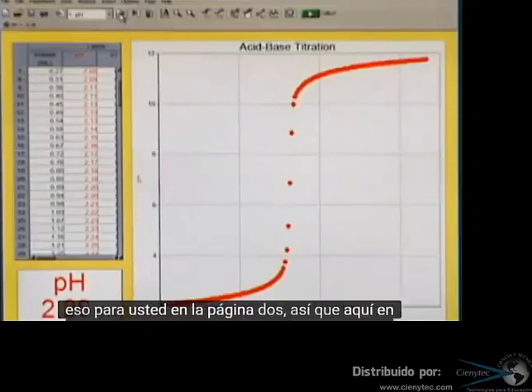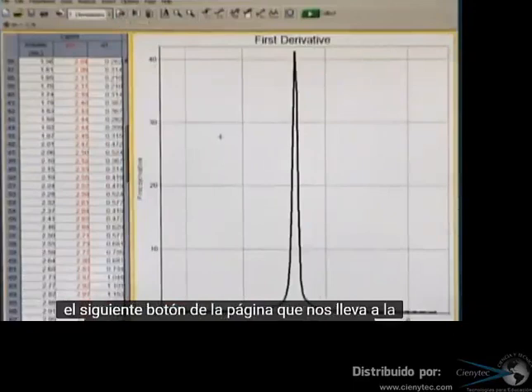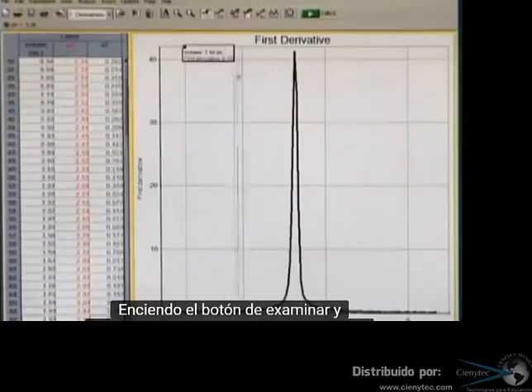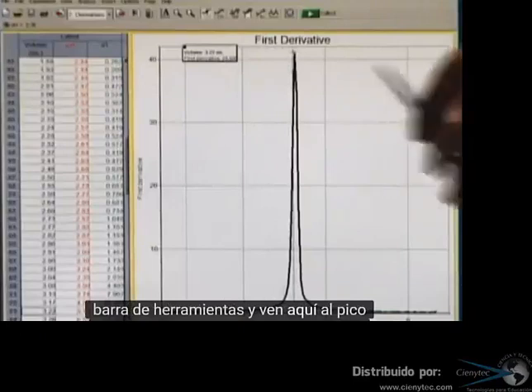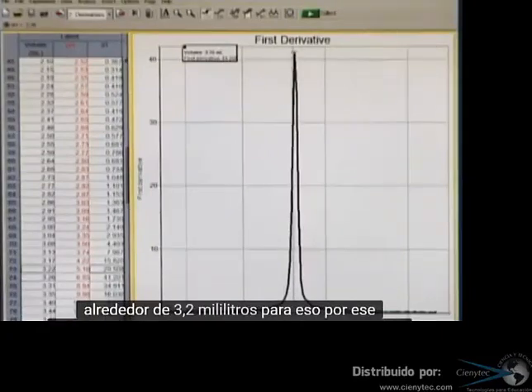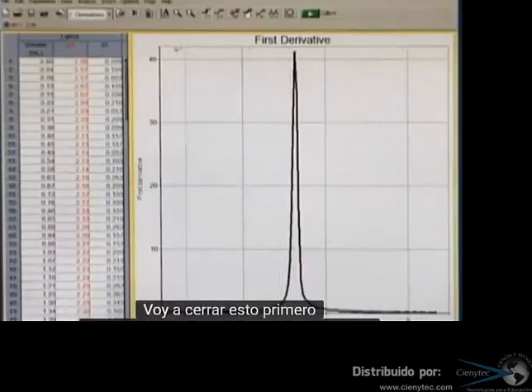So up here in the toolbar I'm going to click on the next page button, which takes us to the first derivative. The peak of this first derivative is going to tell us what our equivalence point volume would be. If I turn on the examine button on the toolbar and come over here to the peak, it is showing us that the volume is around 3.2 milliliters for that equivalence point.